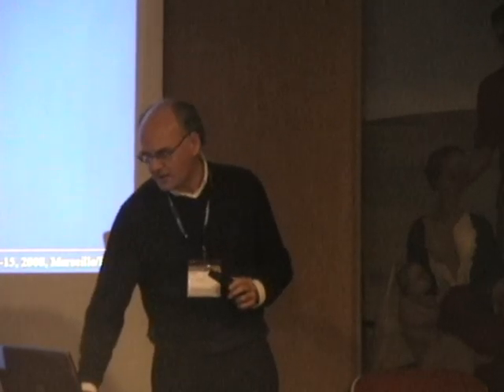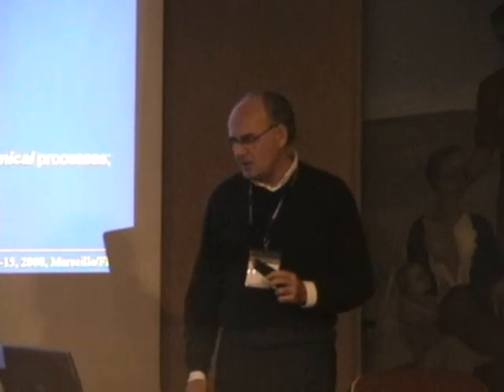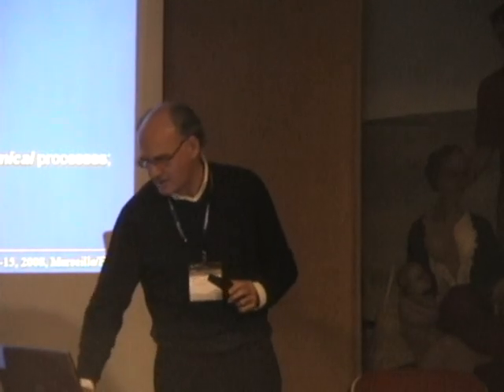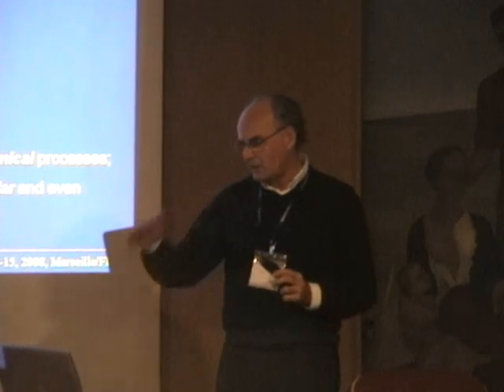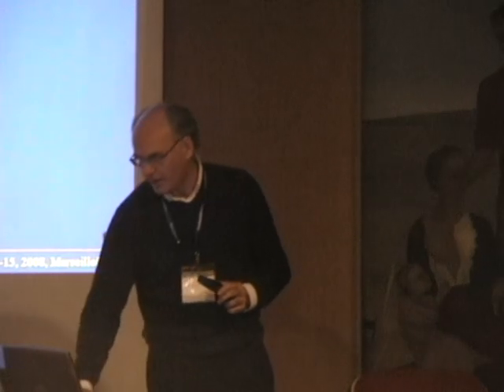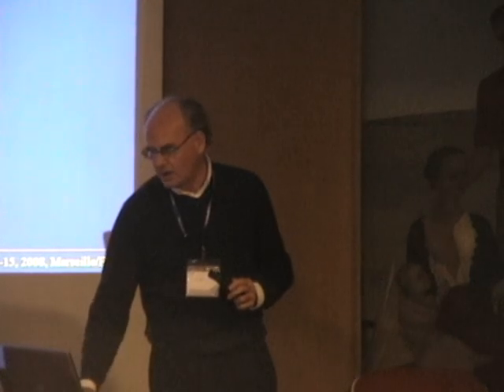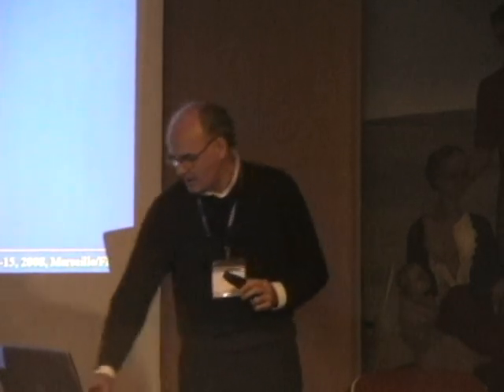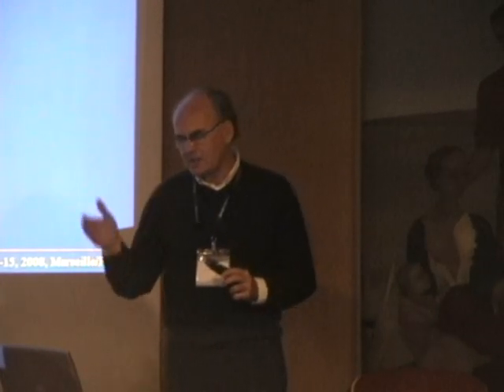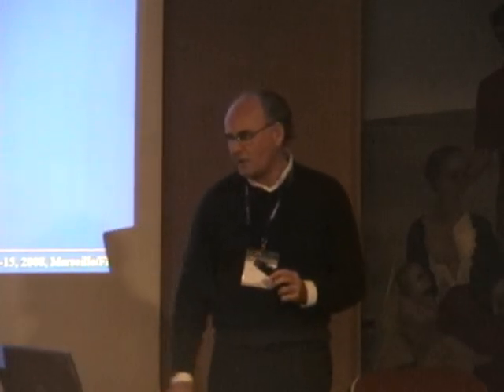The background is that tissue excision and extraction are invasive procedures, physical and chemical processes that actually alter tissue at different levels: macroscopic, cellular, and for extracts on the supramolecular and molecular level. So, alterations due to tissue excision: first of all you have ischemia, because at the moment when you excise your tissue from the animal, you cut blood vessels, there is no blood flow anymore, immediately you have ischemia, no more blood circulation. A consequence of that is hypoxia.